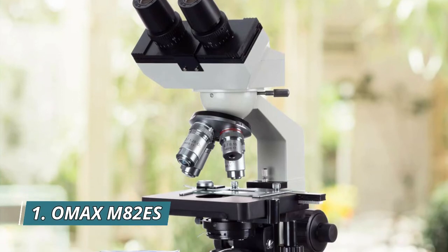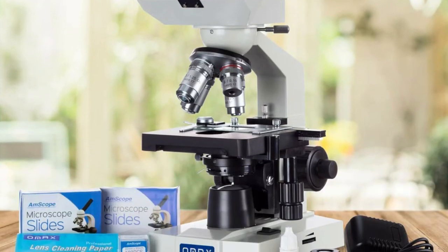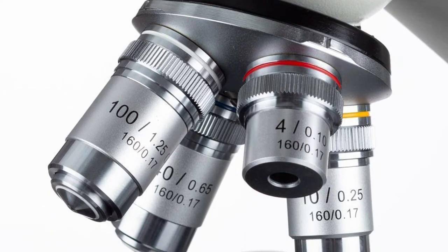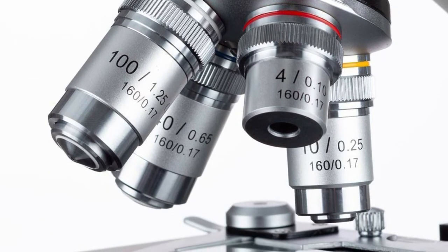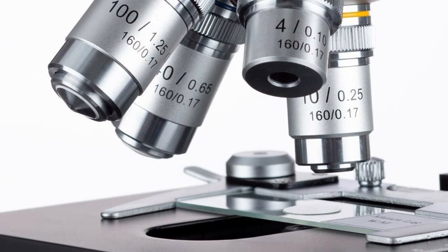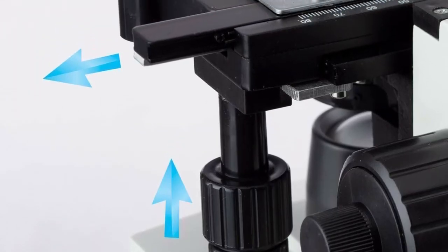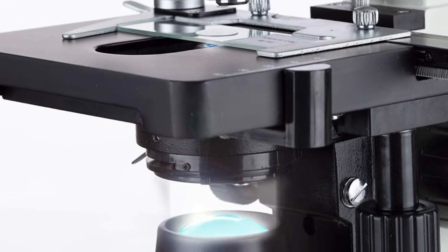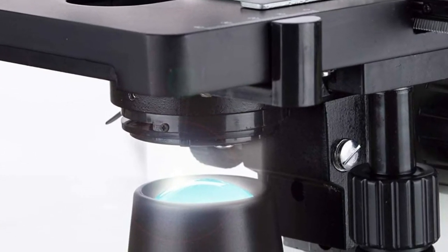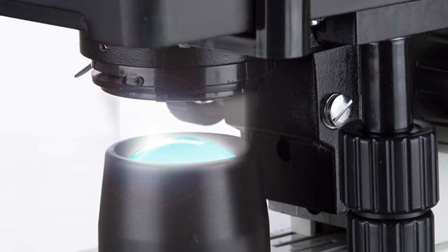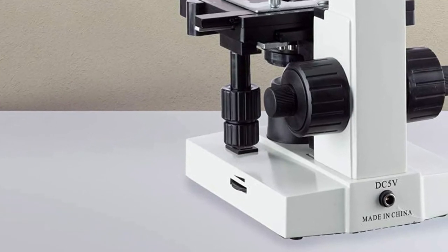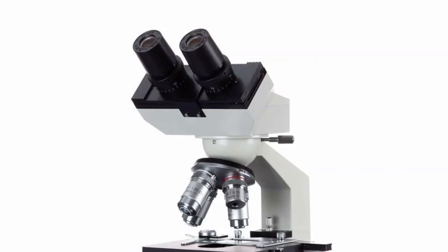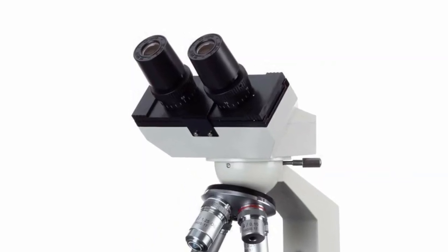Number 1 OMAX M82ES, 40x to 2000x magnification eyepieces, wide field WF10X and WF20X. Objectives achromatic DIN 4x, 10x, 40x S, 100x S oil. Viewing head 45 degrees inclined, 360 degrees swiveling binocular. NA 1.25 Abbe condenser with iris diaphragm. Illumination transmitted lower LED light intensity adjustable. Focus coaxial coarse and fine knobs on both sides. Full solid metal frame construction with stain-resistant enamel finish. Power supply AC/DC adapter, UL approved. Input 100-240V. 100-piece blank glass slides with 100-piece cover slips and 50-sheet lens cleaning paper included.